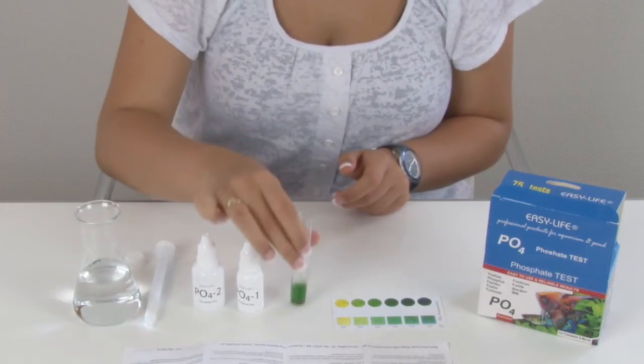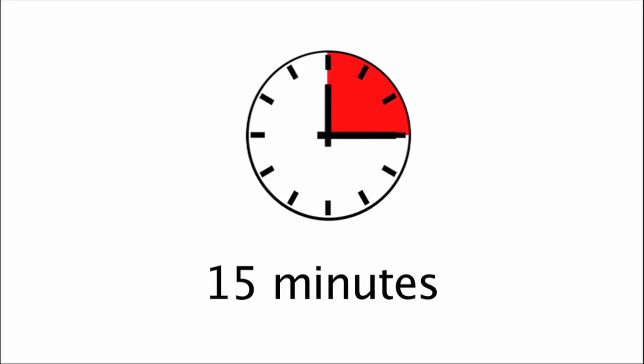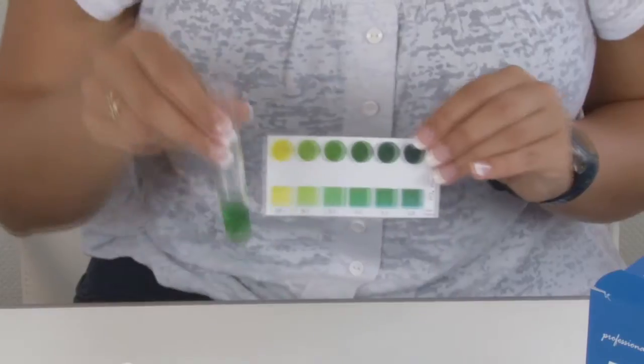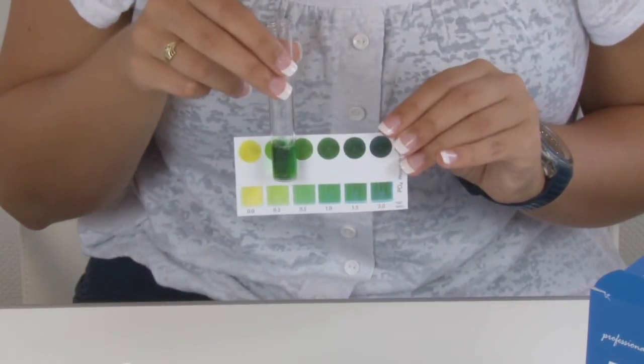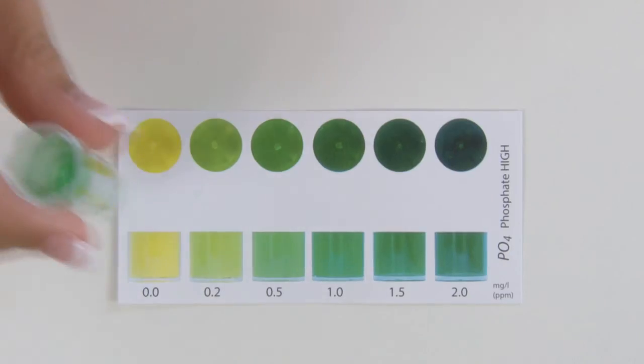Shake a few times. Wait now for 15 minutes. There are two ways to compare the color of the liquid: hold the tube against the color chart, and or watch it from above.